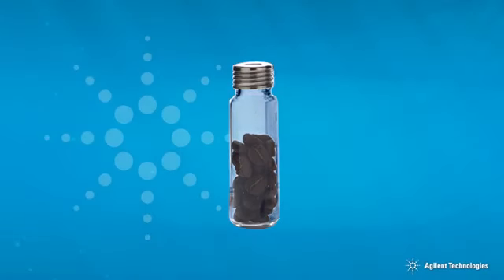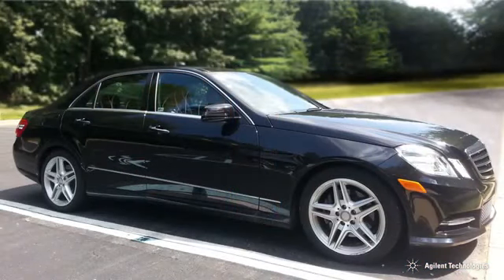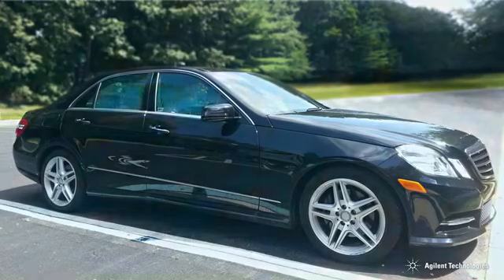Or by placing the sample into a sealed vial and heating it up. As the sample is heated, volatile chemicals will be evaporated into the headspace of the sealed vial, which can then be injected as a gas into the GC. Think of how you smell chemicals in a new car that has the windows closed and is sitting in the sun. The car has become a huge headspace vial, and your nose is the detector.